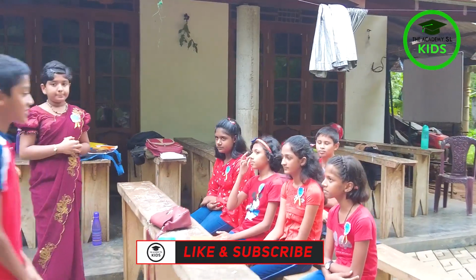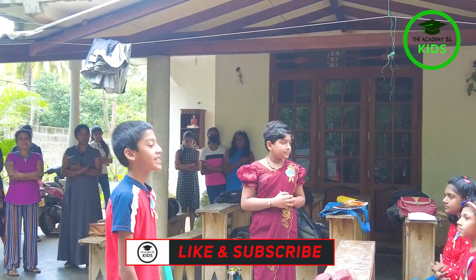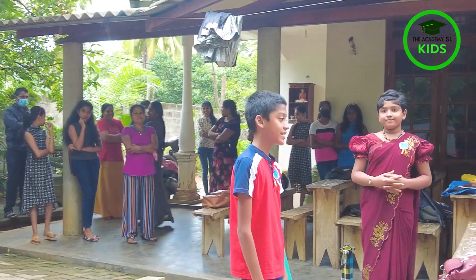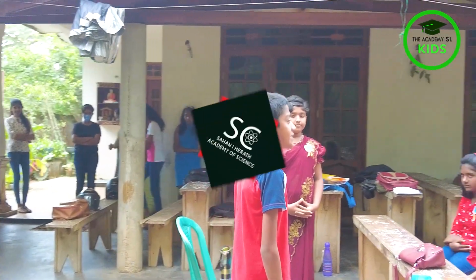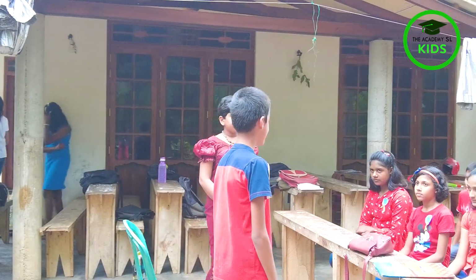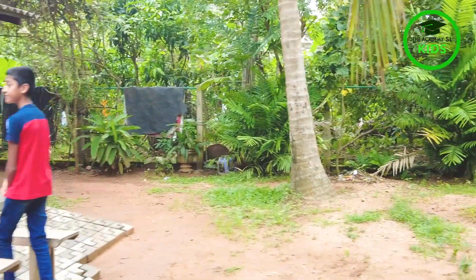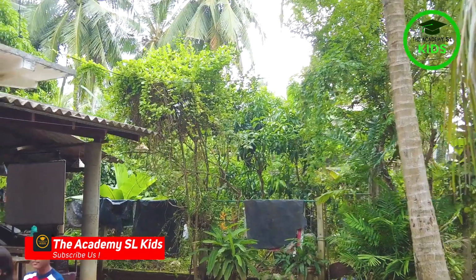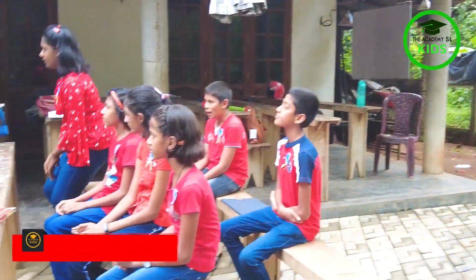The simple microscope is a small device used to magnify the image of an object. This microscope can be produced by fixing the frame to a convex lens. This microscope is also known as a hand lens. Convex lens and hand. Who can say what that is? Sure, sir. Come and complete it.